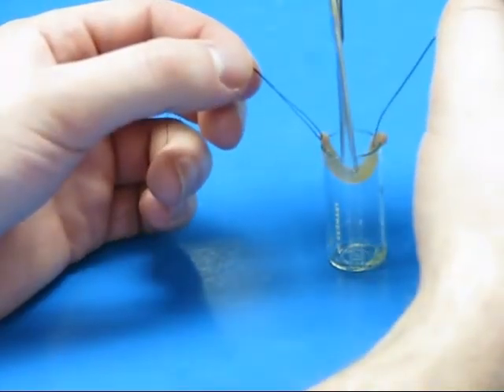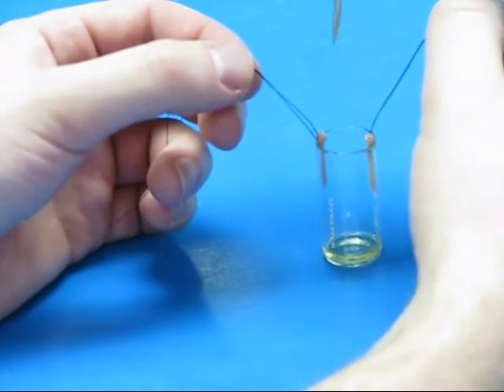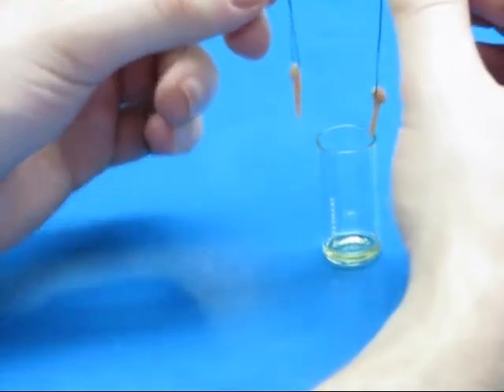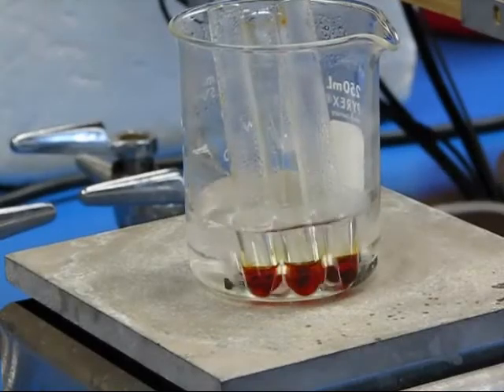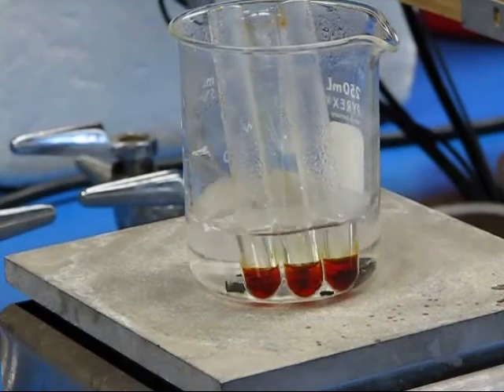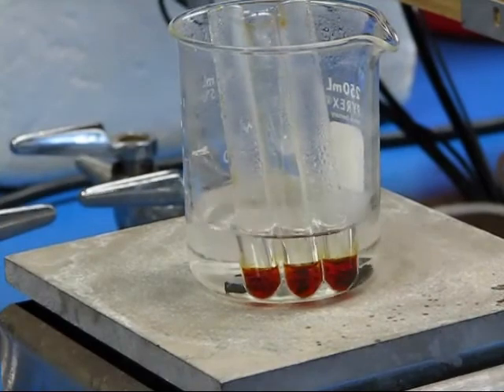After one hour of incubation, you will empty the contents of each sac into a tube. Follow the instructions in your lab manual to combine the test solutions with the right amount of DNS reagent and distilled water in a labeled test tube. Place these tubes in boiling water for five minutes to bring about the color change.